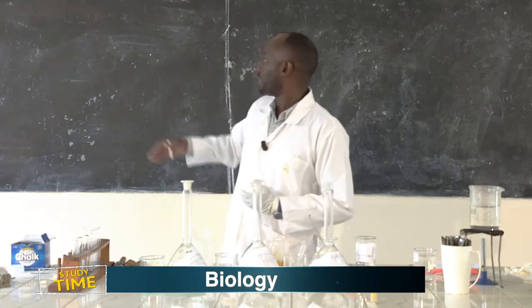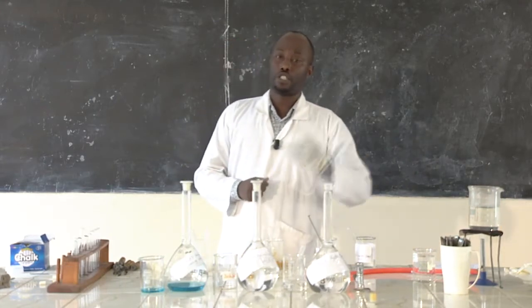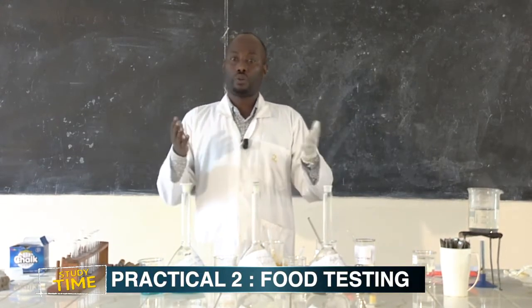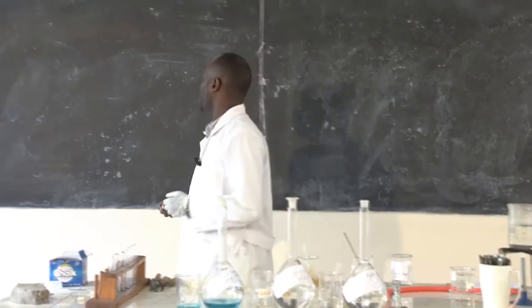Students, the biology lesson of today is a biology practical lesson. I want to remind you to take your exercise books and notebooks, and write down somewhere the important notes of what we're going to do today. Students, that is the lesson of today.